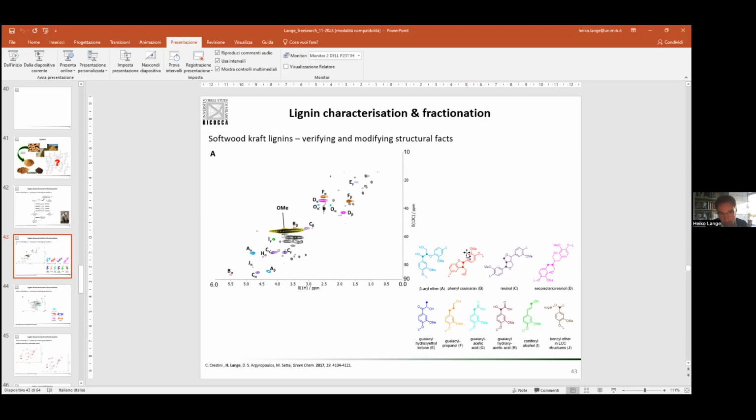Then if you want to see all the carbons without having interferences with the hydrogens and the oxygens, we go for the quantitative carbon that I mentioned, but I didn't put too much emphasis on it, right? So you get the point, right? We try to reduce complexity by choosing the right analytical method for targeting one of the features. Then we need to recombine it essentially, right?